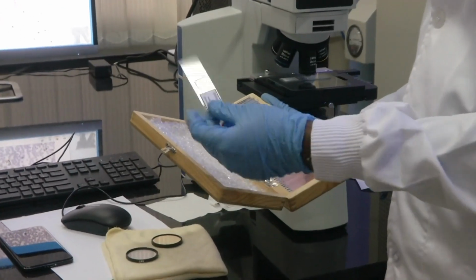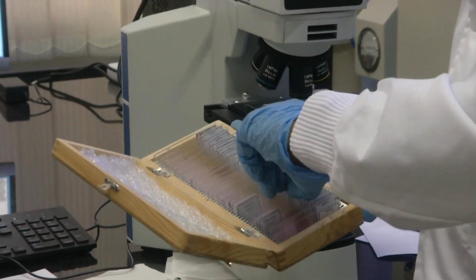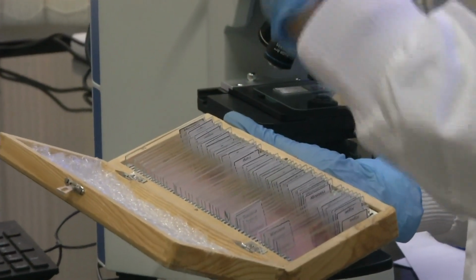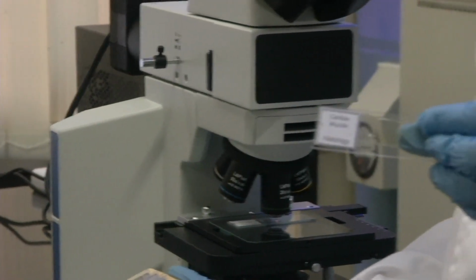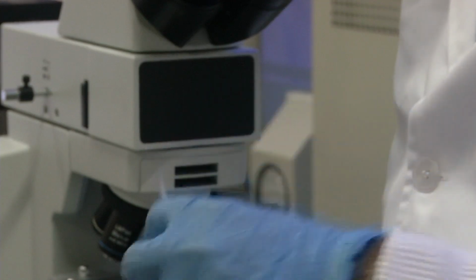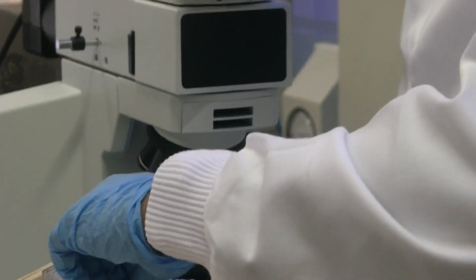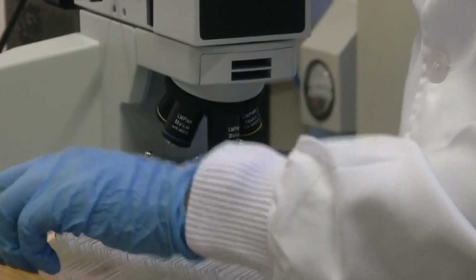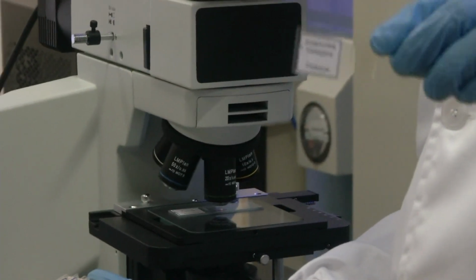So, let us say this is histology of mammalian cells, and this is cardiac muscle histology. Can you see this? Cardiac muscle histology. Let's see one more, I will randomly select. We have Entamoeba histolytica, which is a protozoa.